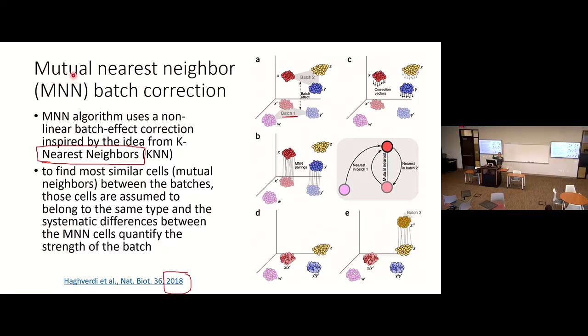Once you build those links, you merge them and put them together. Like this yellow group, there's no correction, so it still stays as an isolated new population. Unless another batch comes in, and then you do the same thing and merge by distance.